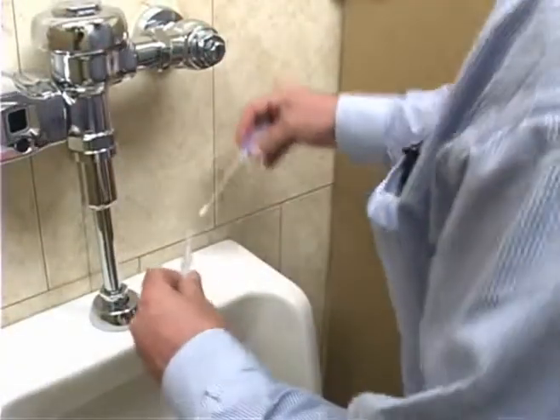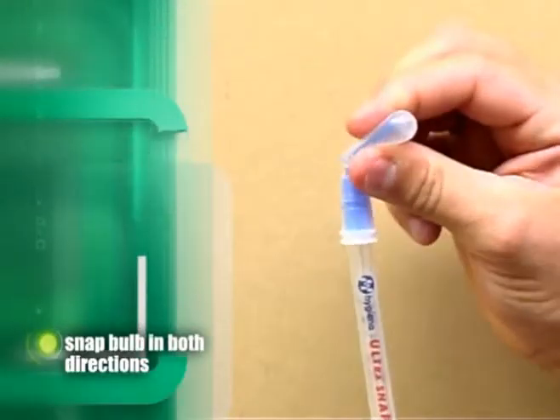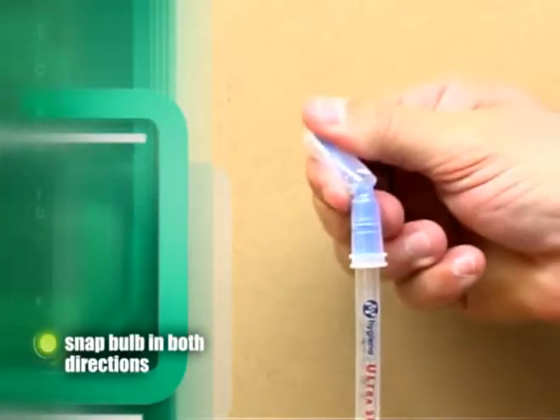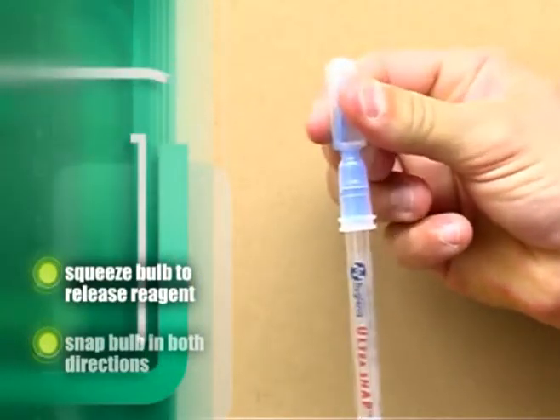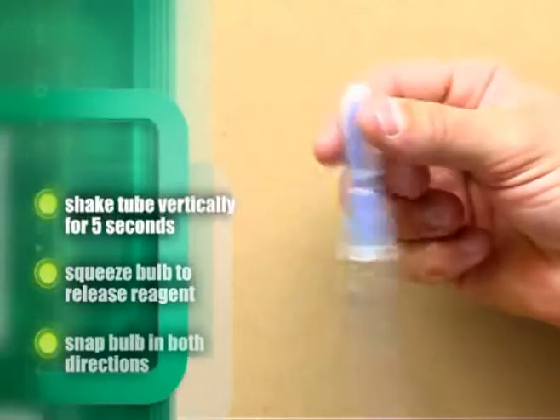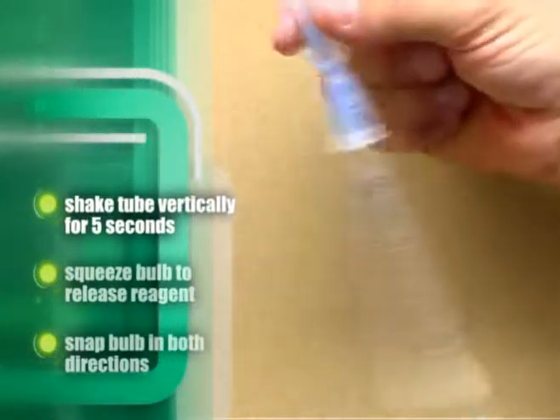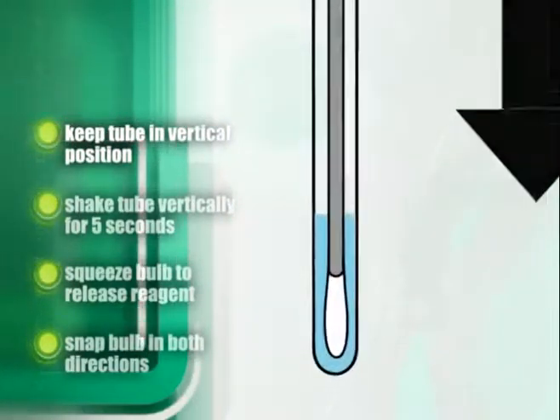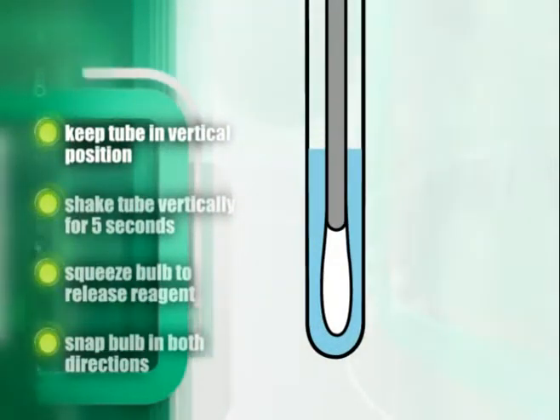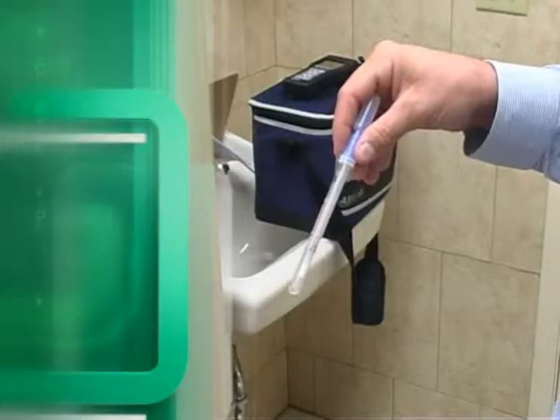Immediately after swabbing the surface, return the swab to its tube. Snap the end with fluid by bending the bulb in both directions and squeeze until all liquid has been released to the bottom of the swab tube. Holding the tube vertically, shake the swab back and forth for 5 seconds. It is important to keep the swab tube upright to ensure that the liquid reagent comes into contact with the swab tip. Your swab is now ready to be tested.